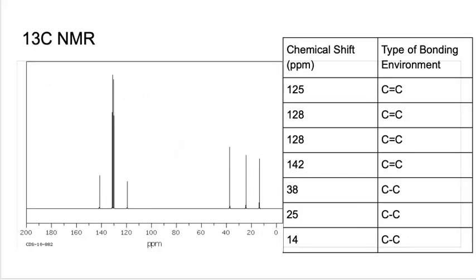Moving to our next slide, this will be the 13C NMR that was given to us. There are 2 things you want to look at when analyzing these 13C NMRs. The first one is going to be symmetry, which I will come back to later, and the second is going to be dispersion of chemical shifts in relation to further or less downfield. So, when looking at chemical shifts, there is a range of 200 to 0. The less electrons or more electronegative atoms around the carbon, the higher magnetic field the nucleus is exposed to. Hence, it is harder to flip, and the ppm value is higher.